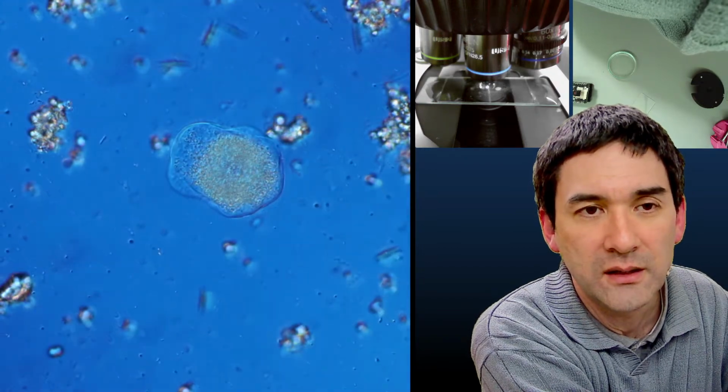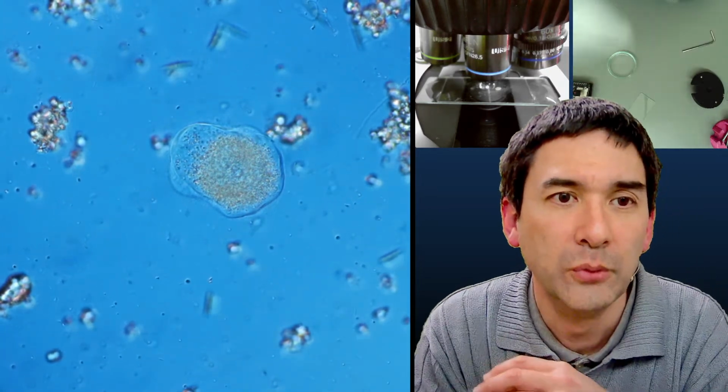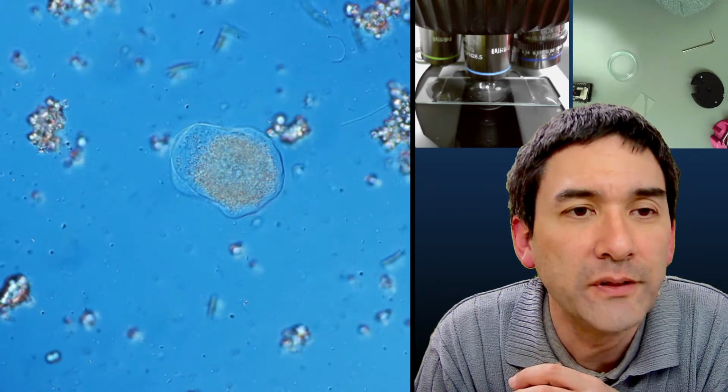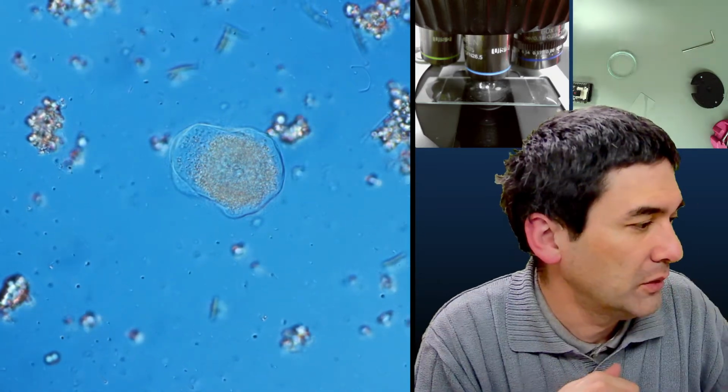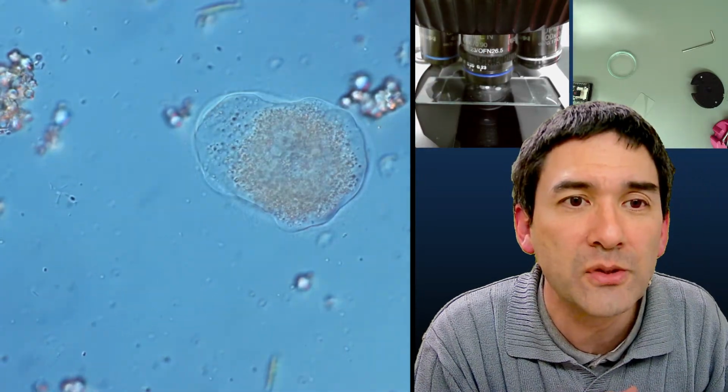And as I said, usually I like kind of the bluish color. See, the cell has now regained a little bit of its shape, but I don't know. That's what it is. So let's go up again a little bit. This is now 60 times. I have to open the diaphragm now as well.